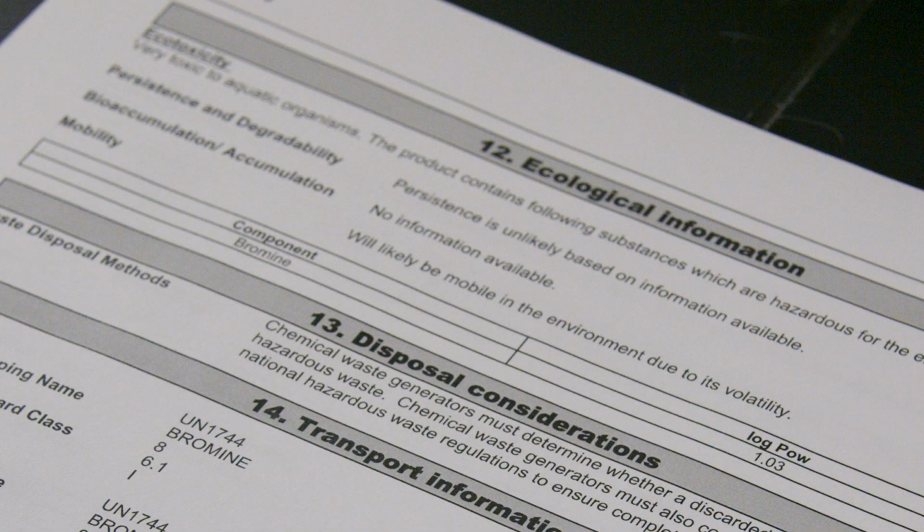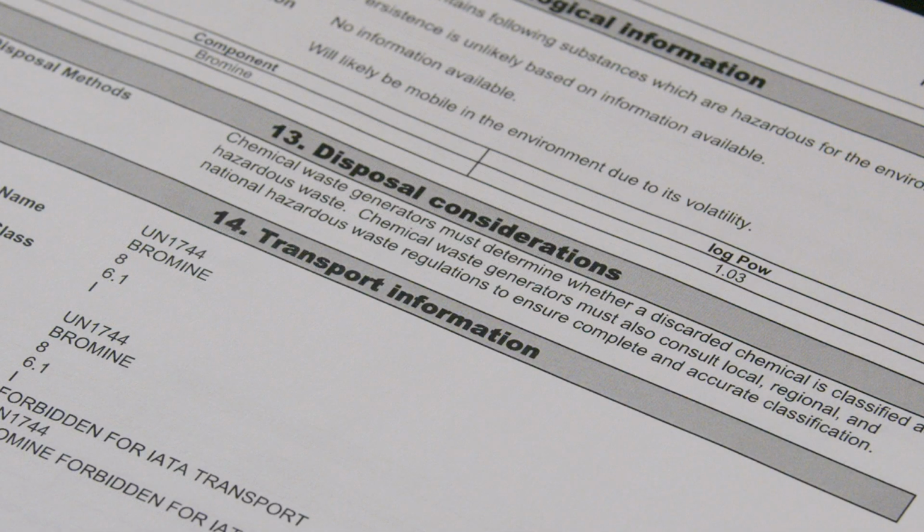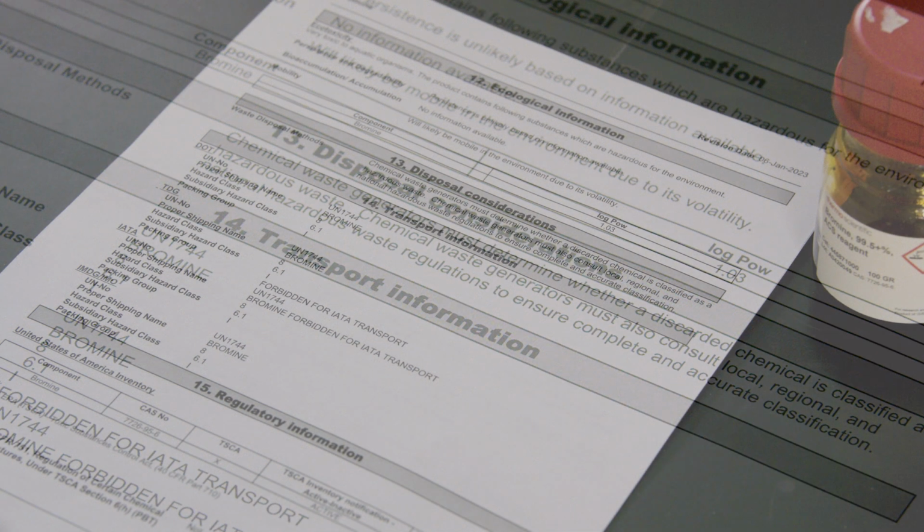Section 12, Ecological information, tells you about the impact of the chemical on the environment. It's like learning the chemical's ecological footprint. Section 13, Disposal considerations, guides you on how to properly dispose of the chemical and its packaging. It's all about being environmentally responsible.